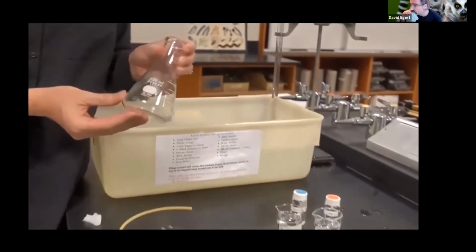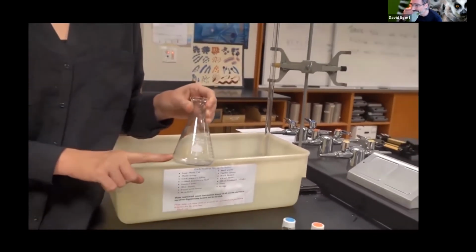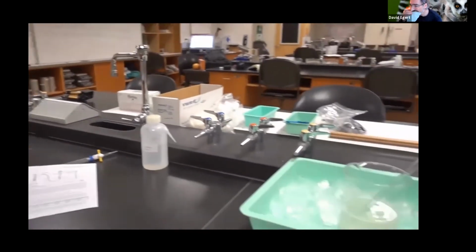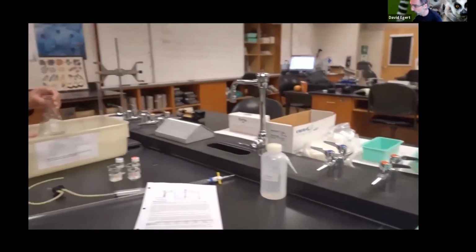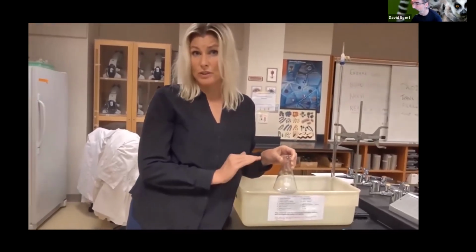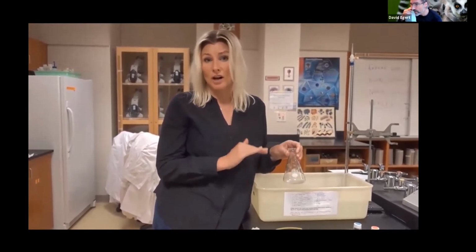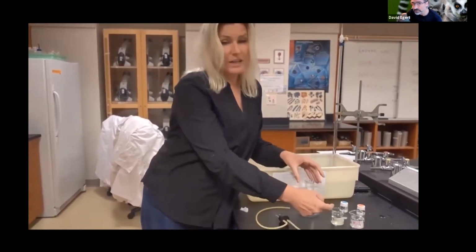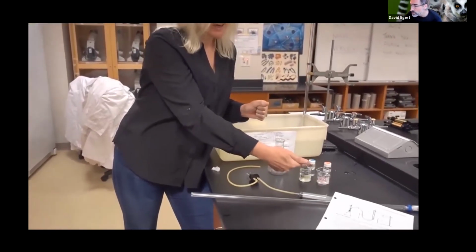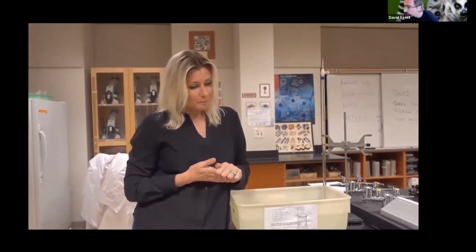Someone else in your group has probably been nice enough to go over and get the enzyme extract that we made earlier. You're going to have the same amount of enzyme for each trial. So it's always going to be 10 mL, which means that in this experiment, we're keeping the catalase concentration constant. What we're varying is obviously the concentration of hydrogen peroxide for each of the trials in the experiment.